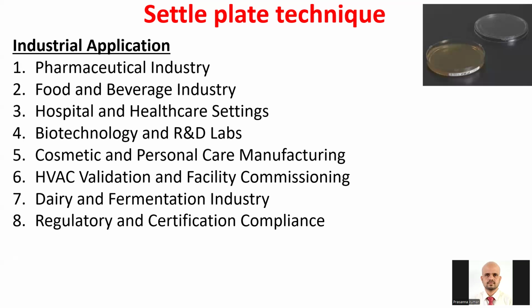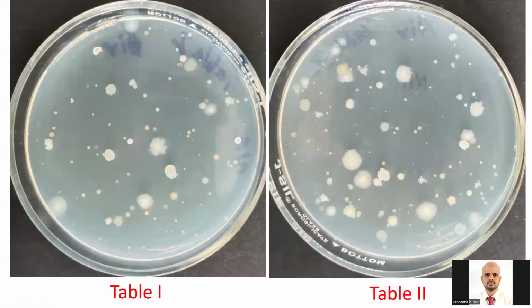So I thought we would do an assessment of the room we are going to use for phytomicrobiology. This is a very easy technique: low cost, non-instrumental, and easy to implement. That's why the interns took the challenge of assessing this. Yesterday, on our day one, we put a plate in two different places. These are those two plates, nutrient agar plates.